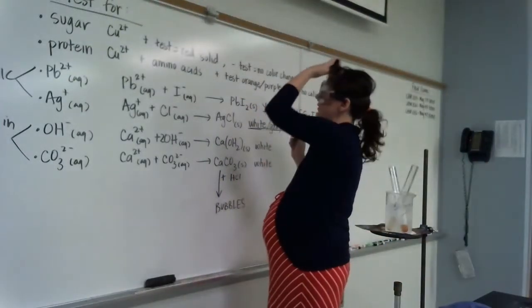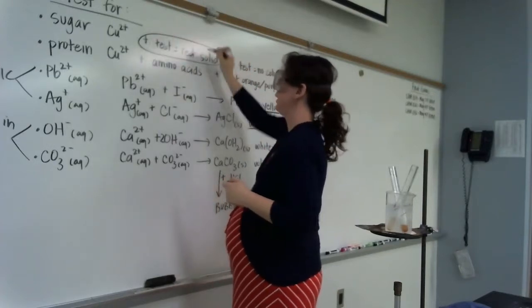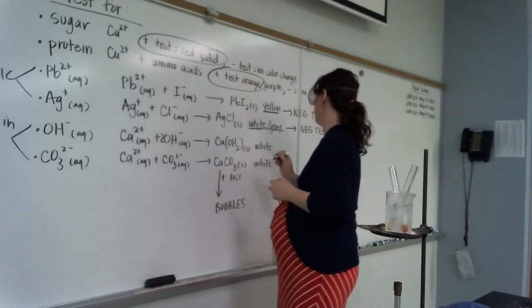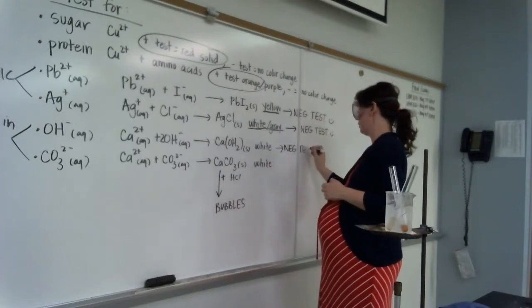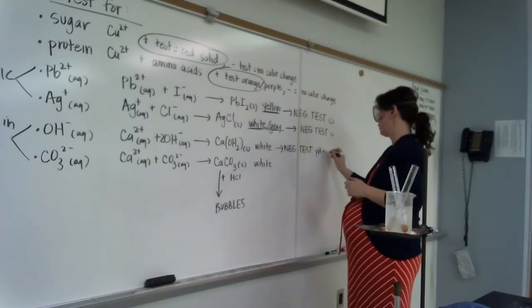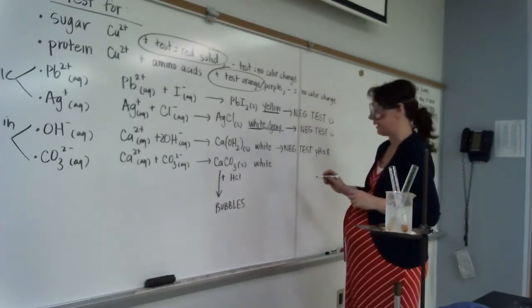This one is a positive test. And this is a positive test. This we're going to conclude is negative because the pH is about 8, which is kind of where you'd expect it to be for a lake.